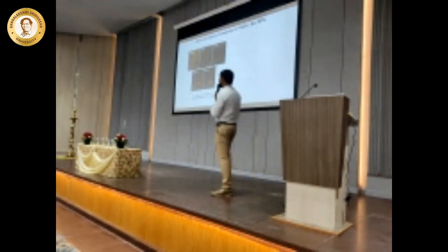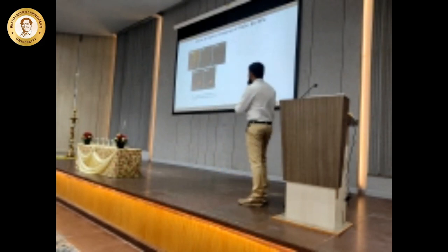So can you see here, this is not an optical imaging system, this is an X-ray imaging system. I excited my powder sample using an X-ray, and I could see a beautiful red luminescence. This luminescence changes depending on the voltage that I'm giving here. I'm increasing my voltage, say 50 kilovolt, 100 kilovolt. That's what we do with an X-ray system, right? We tune the parameters of voltage, current, and exposure level. Depending on this, by increasing the voltage, we get a beautiful red luminescence.